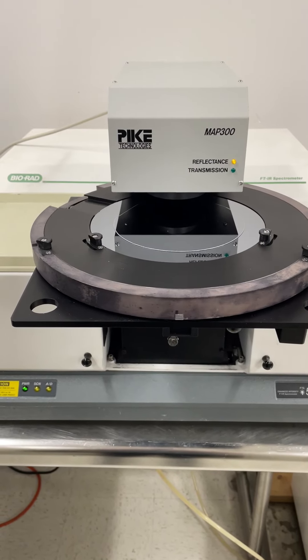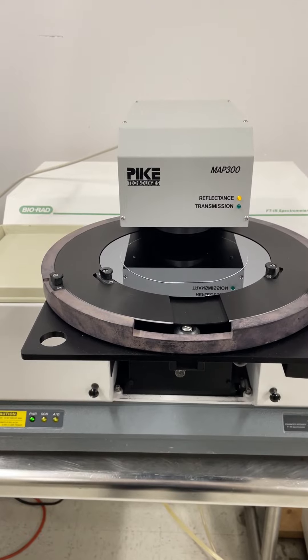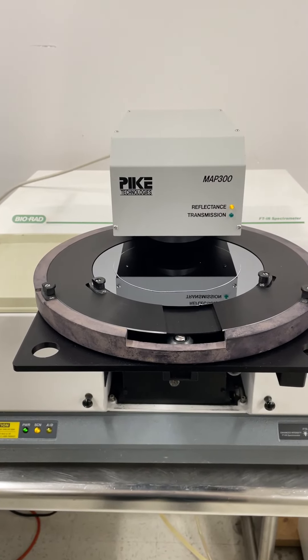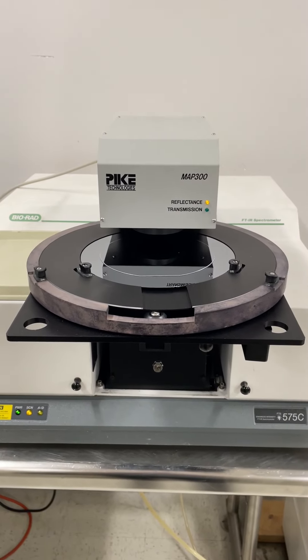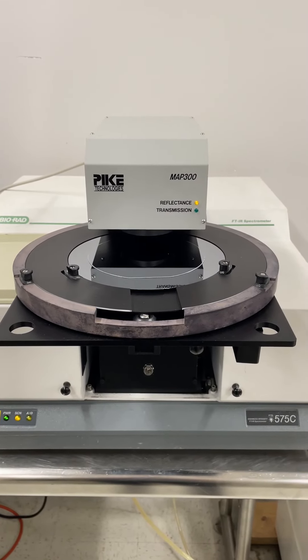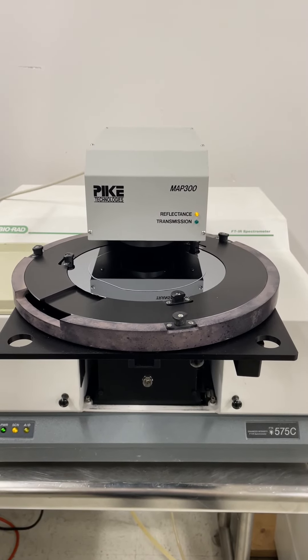Now it's going around to the other half of the wafer. I'm not sure why it's programmed to move through the wafer this way, but it does. Three more test points.